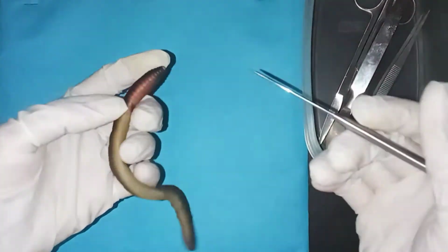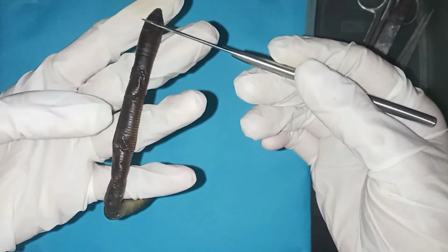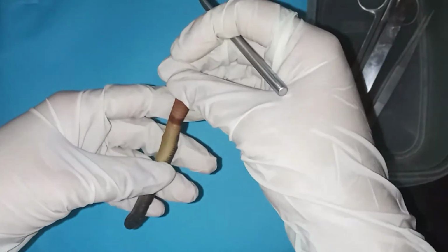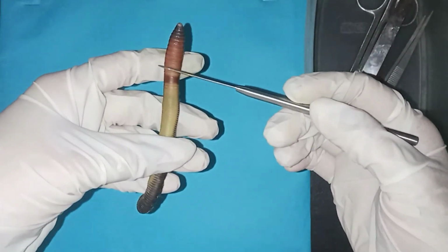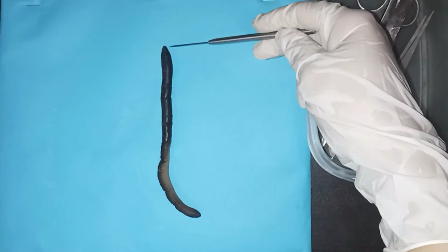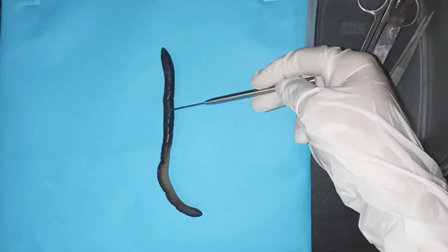To identify the dorsal and the ventral side of the earthworms, the dorsal side of the earthworm has a darker color, while the ventral side has a lighter color. Usually, the internal organs of the earthworms are located in the anterior region, or the anterior part.